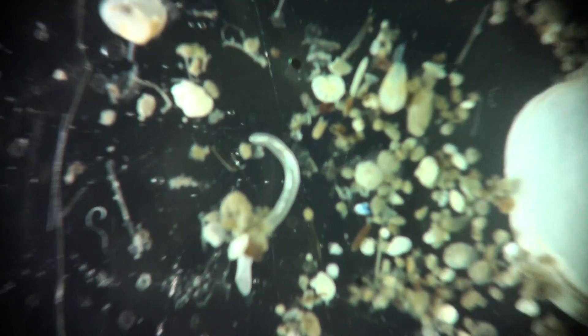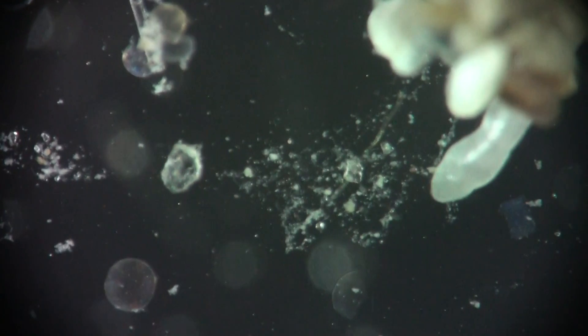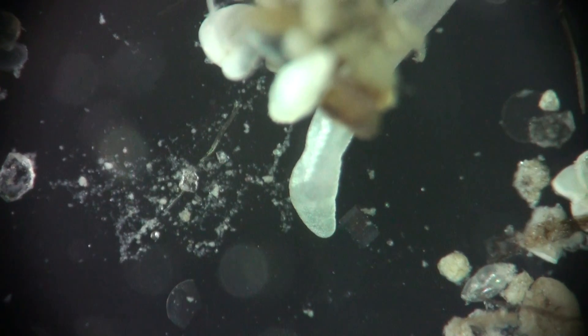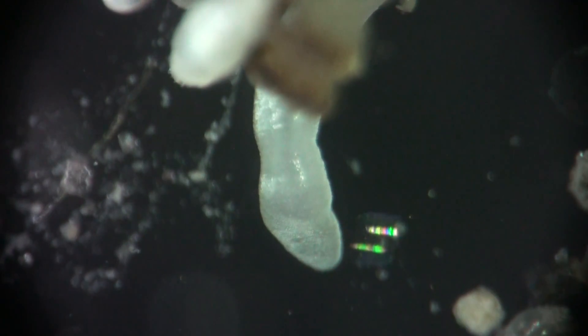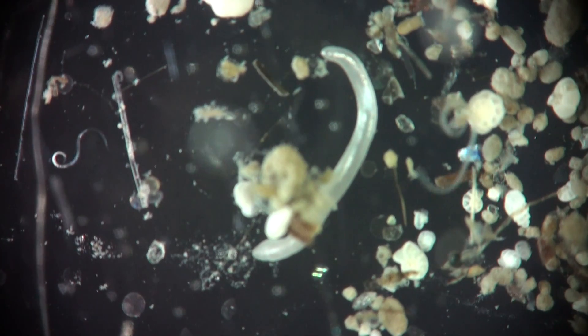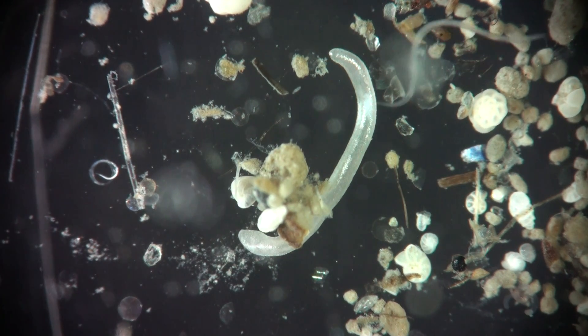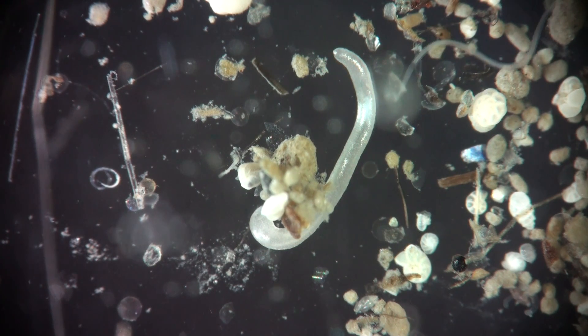No suggestions. Is it a flatworm? No idea? Is it an emertian? Is it a rotifer? No. Okay, so we established it's not a rotifer. It's a mollusk.